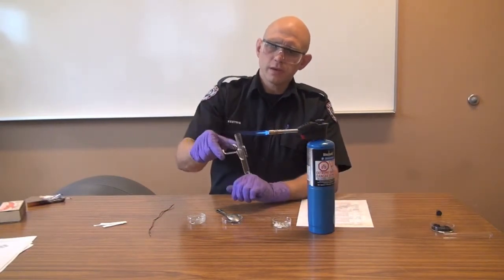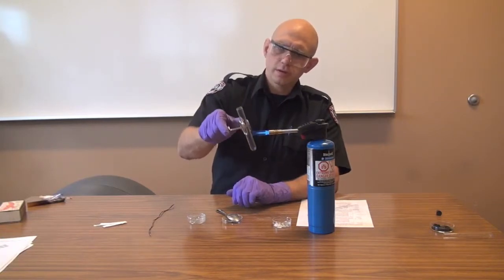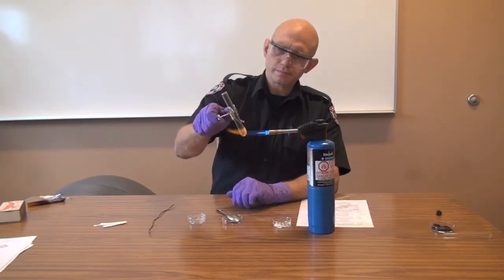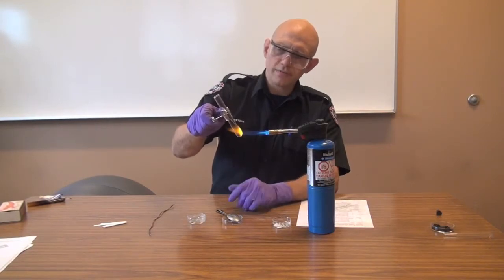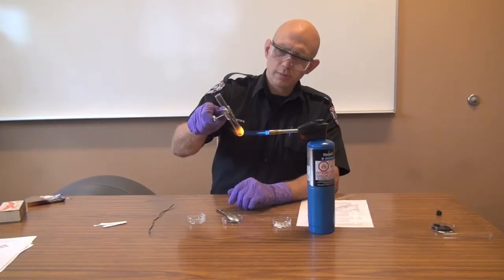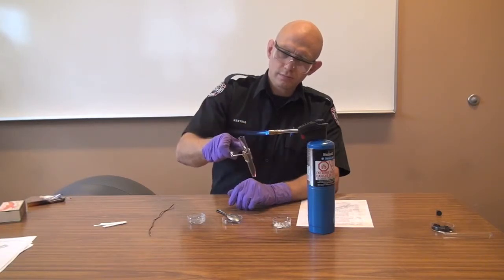So we have a flame, and I'm starting to heat the test tube — not right here, because that will eventually melt the test tube. Once it's warmed up, I'm going to start heating the sample at the bottom. Once it gets hot enough to start releasing vapors, I'm going to see about igniting the vapors at the top.